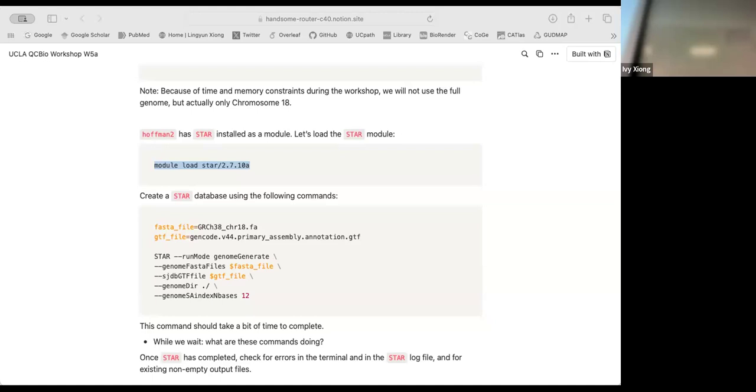Is that the reason why we are using gunzip here? Right, because the original file was gzipped, so we have to use gunzip. They're just different tools to compress, and then you have to use the corresponding decompress tool. Does that make sense?